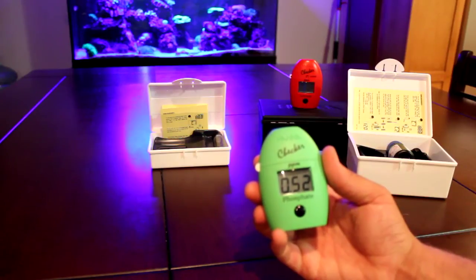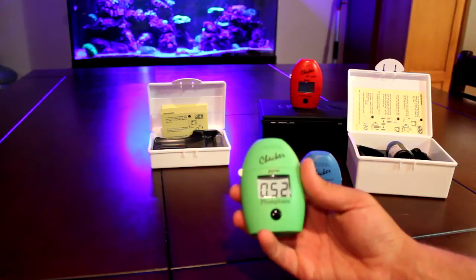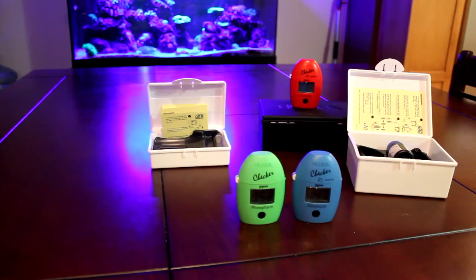Phosphates are 0.52 parts per million - it's a little higher than I'd like but it's still pretty safe. There you go, alkalinity and phosphate done in like 4 minutes.